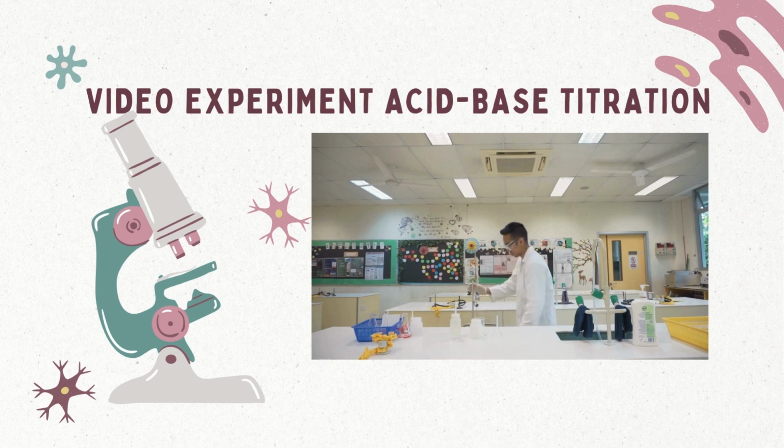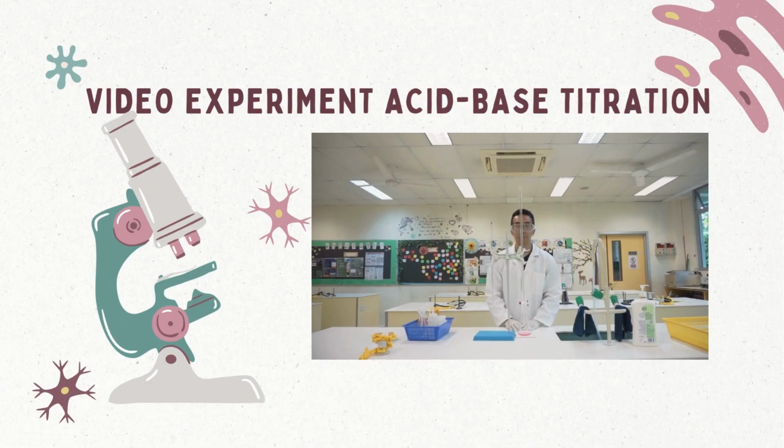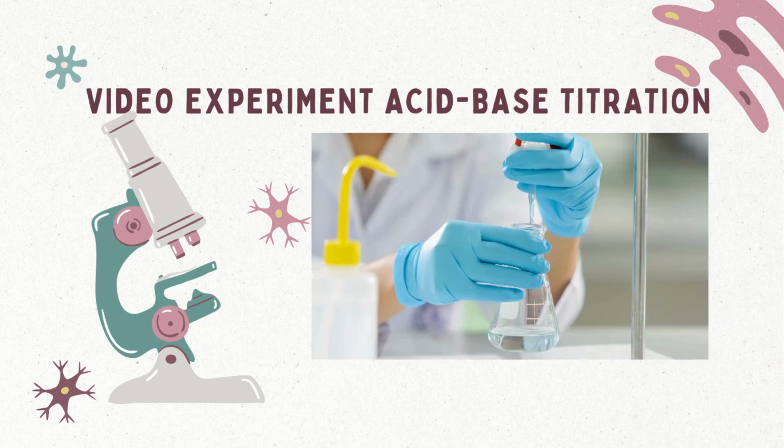Once ready, you may begin your second trial. You may need to fill the burette up to the 0 ml marking again. Feel free to skip this step if you feel that there is enough solution in the burette for a second titration. Either way, note down the initial volume in the burette. Now that you have a rough reading for the endpoint, release all the liquid until you are 1 or 2 ml away from your endpoint. Afterwards, it is crucial that you release the liquid dropwise from the burette.